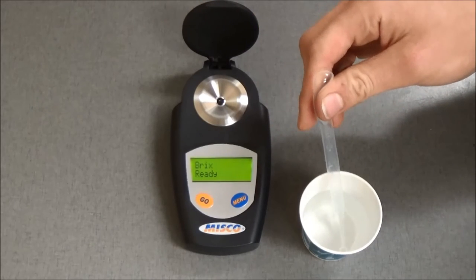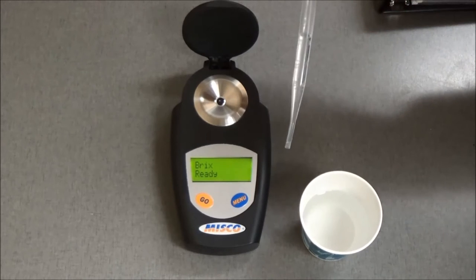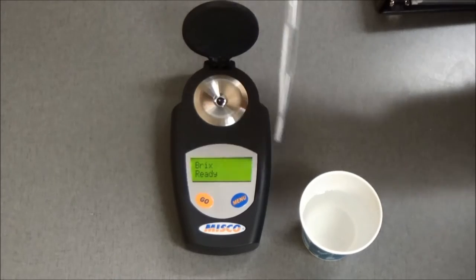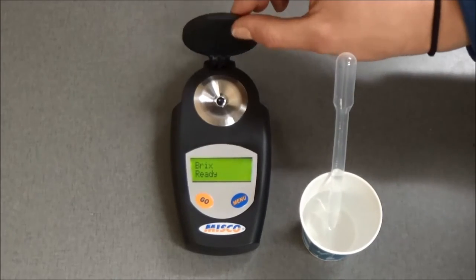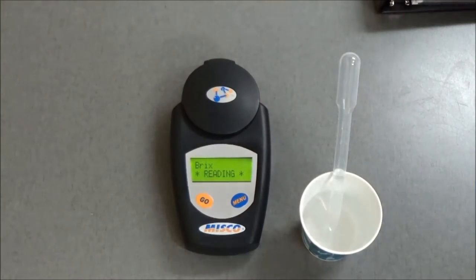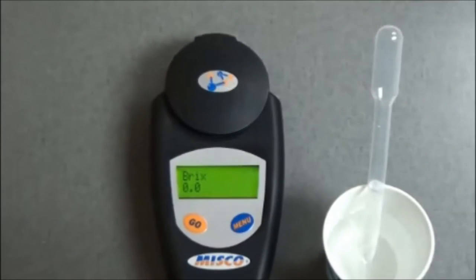To verify the accuracy of your device, place three drops of water in the sample well. Close the lid and press the Go button. The device should read 0.0.